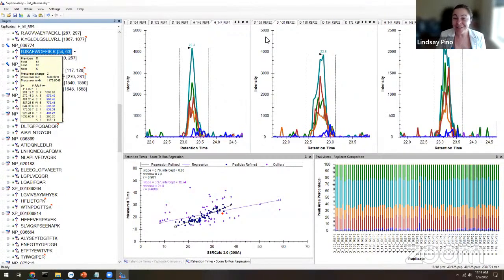For a DIA level experiment where you have tens of thousands, hundreds of thousands of peptides, that's not feasible. In that scenario, maybe you would do your data processing, you would do your analysis, and now you have your list of maybe a couple hundred significant peptides or proteins.